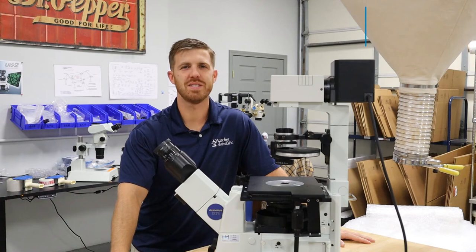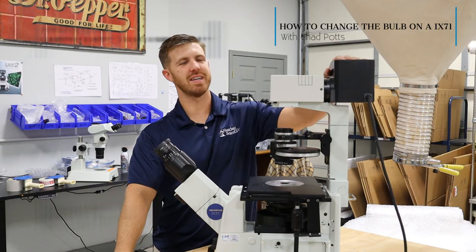Hey, this is Chad with Munday Scientific. Today I'm going to show you how to take off an IX lamp house on a 71 and change the bulb.